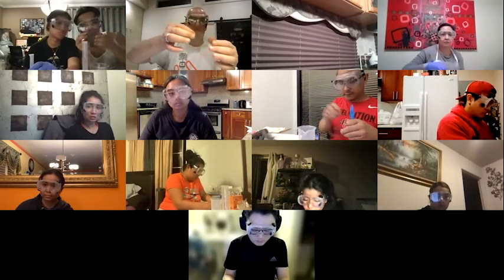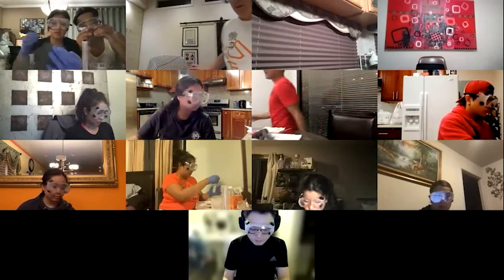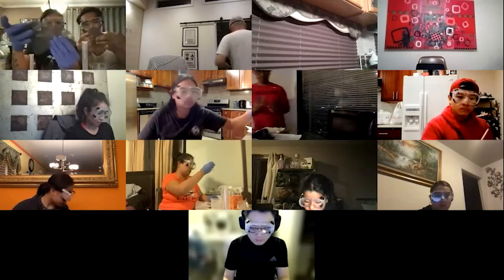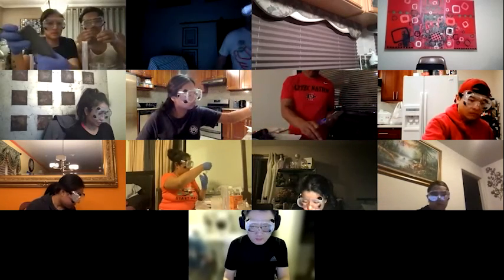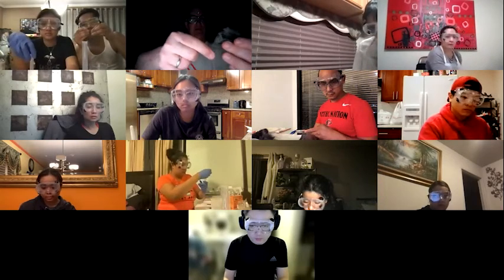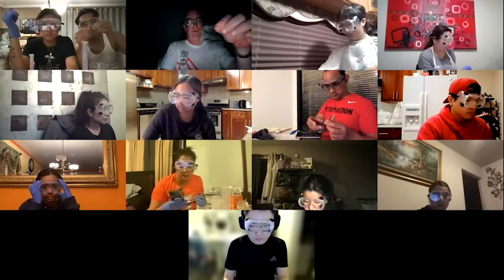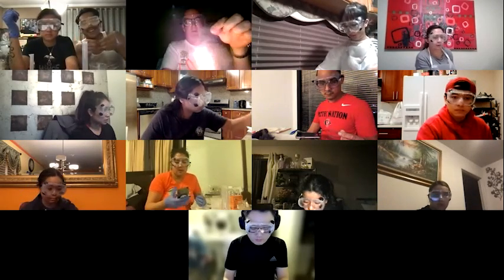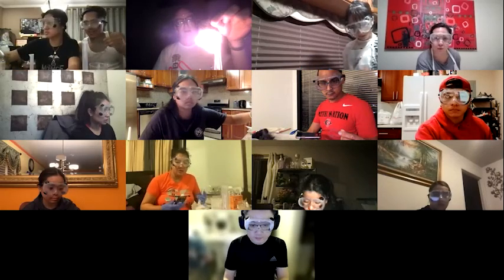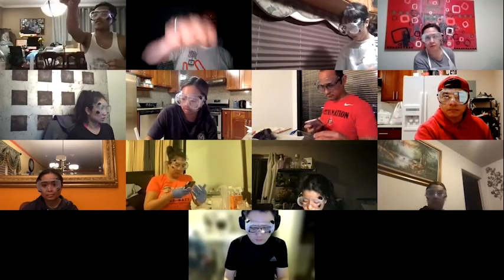I should turn the lights out. That'll be even cooler. Yeah, I'm gonna do that. Here we go. Yes, we stretch it apart till it's super thin. You want to get as much surface area exposed as possible. And hopefully I don't set my computer on fire. There you go. Like fireworks. Yeah, it's really pretty.